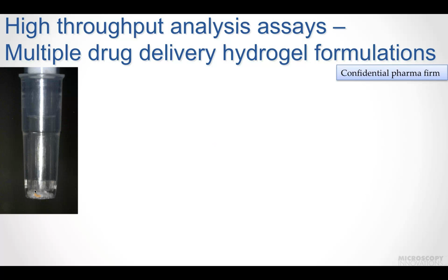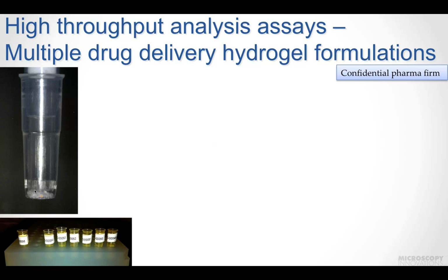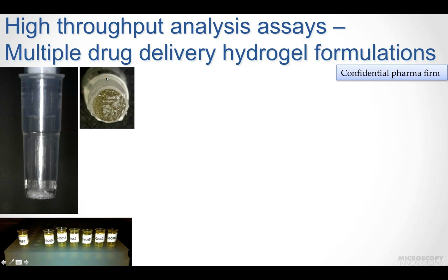So they were loaded into the capsules, and they were simply directly embedded, actually after an acetone rinse, directly embedded in epoxy. Once they were fully embedded and cured, the capsule could be directly chucked into the microtome, and a block could be trimmed directly through these particles. And here we see many of these hydrogel particles, which are about 1/2 millimeter or so inside.